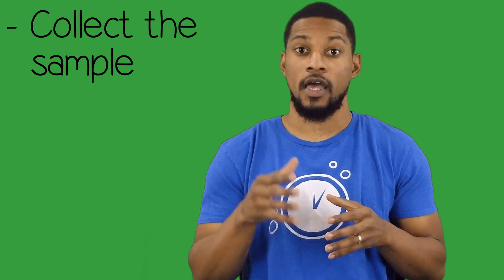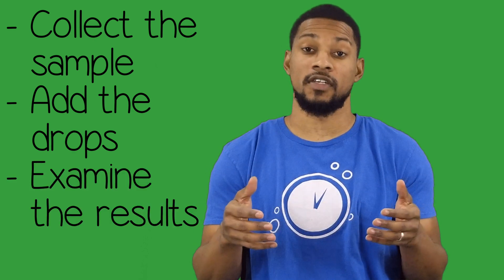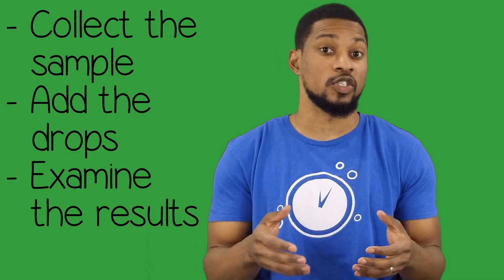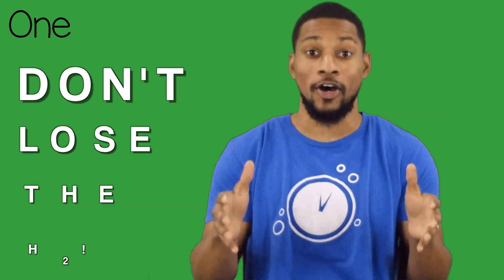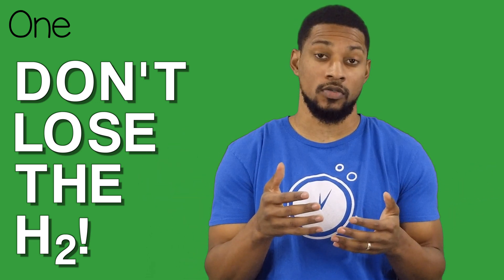So let's walk through this. There are really only three keys when testing with H2Blue: collect the sample, add the drops, and examine the results. But each of these has a correct way and multiple incorrect ways to do them. With each of these there's one key focus: don't lose the H2, or at least try to lose as little H2 as possible.